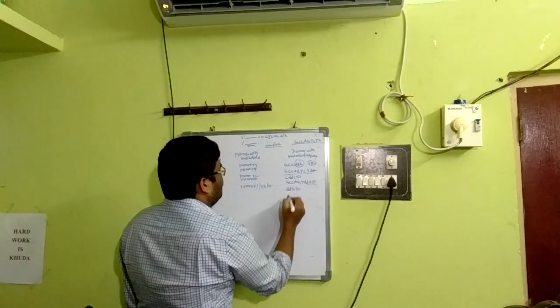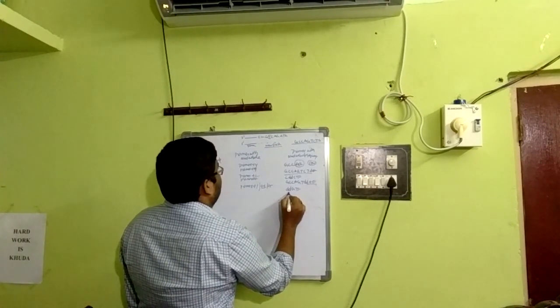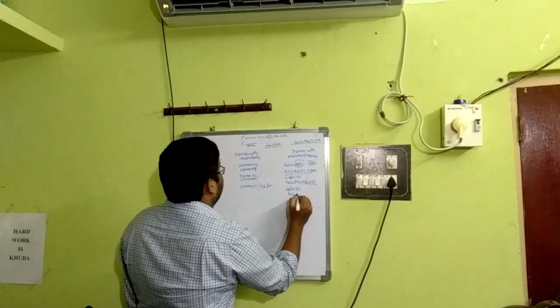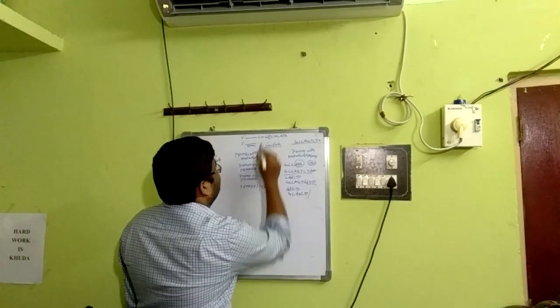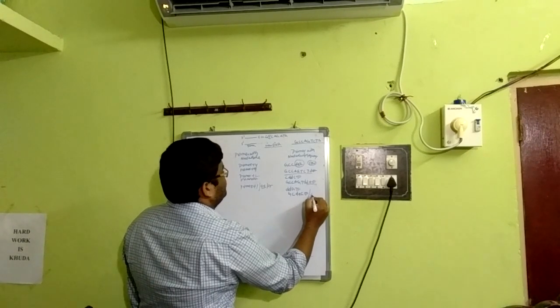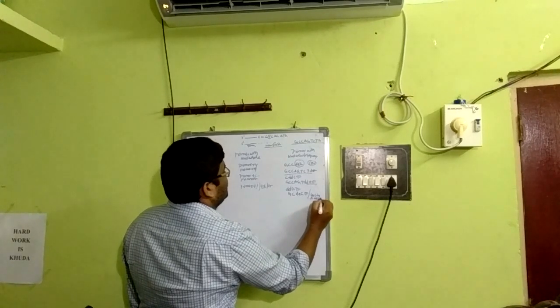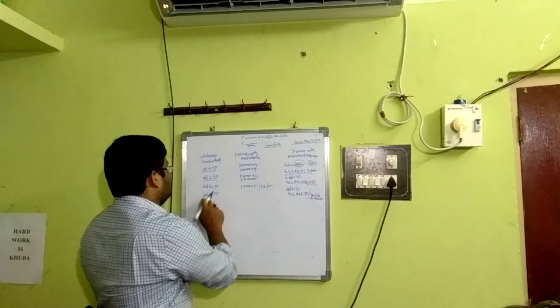According to the sequence, it will be G, G, C, ddGTP. This is 1, and for plus 5 this is C, so G, C, G, A, and ddGTP. Then the last one, ddCTP, ddTTP. Sorry.